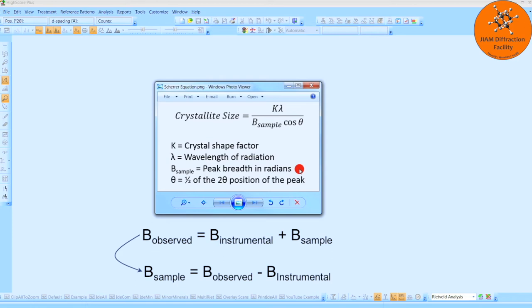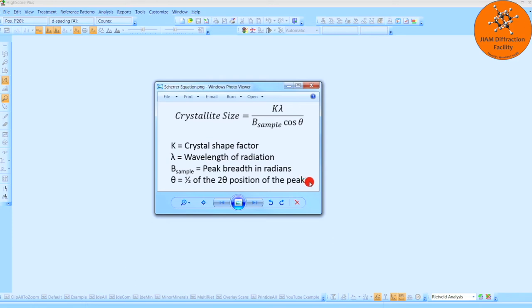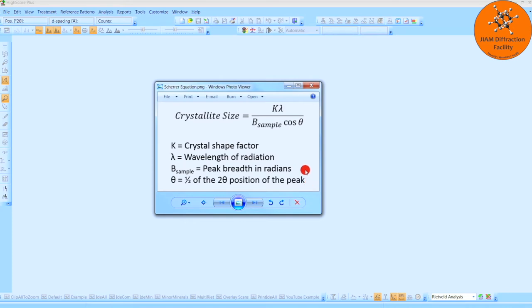So we will have to determine this in a few minutes. And then theta is one half of the two theta position of the peak to which we are applying the Scherrer equation. Now let's go ahead and determine B sample by first determining the instrumental broadening.